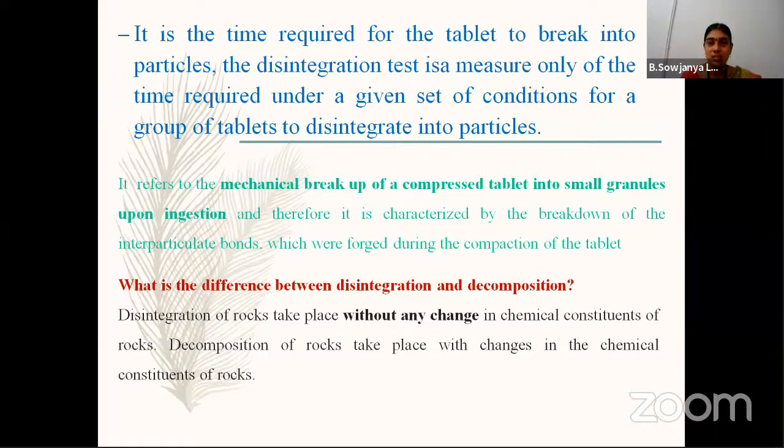This disintegration test is a measure only of the time required under a given set of conditions, so that the disintegrated particles, in the case of granules, the lumps and granules, are finally changed into fine particles that then proceed to the dissolution part.